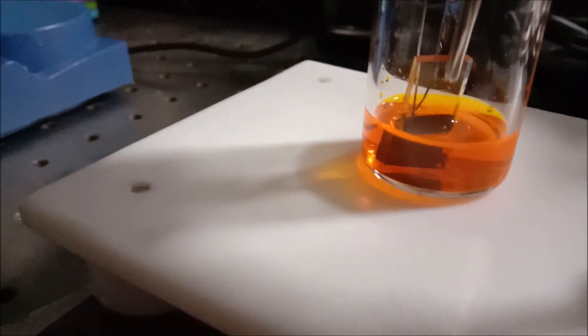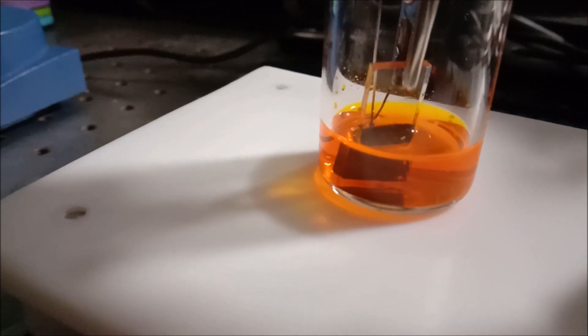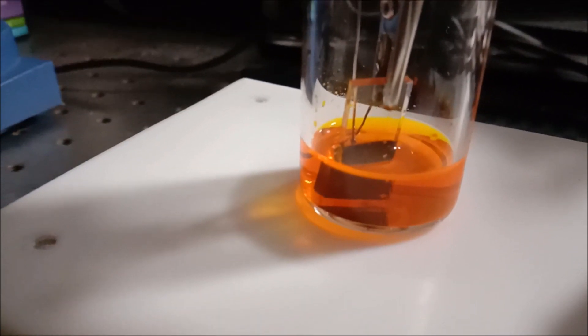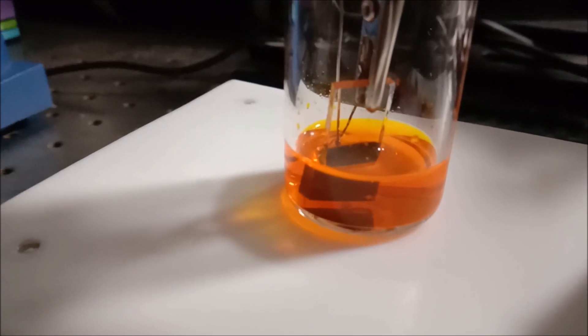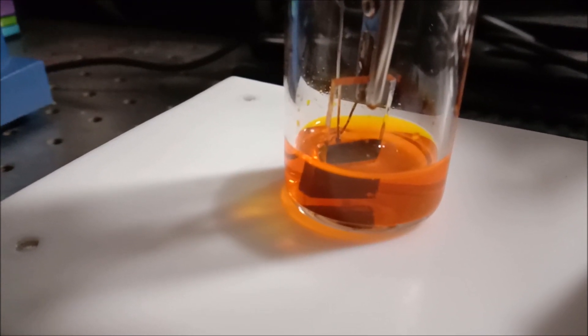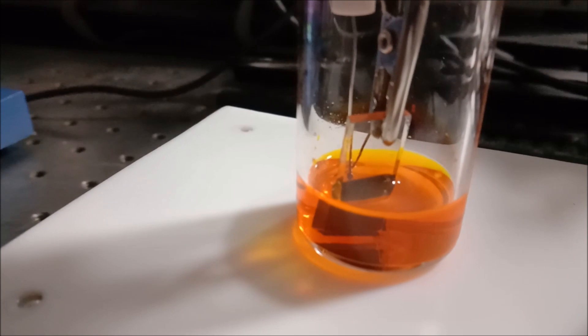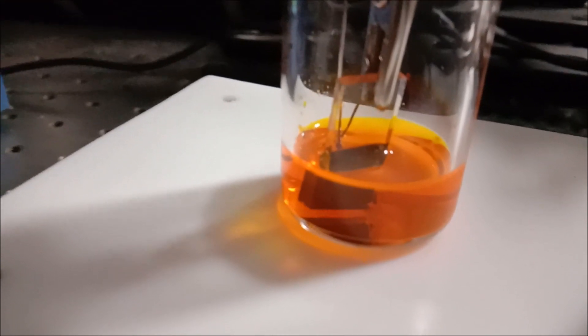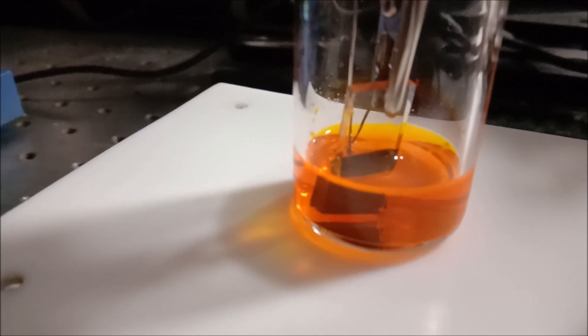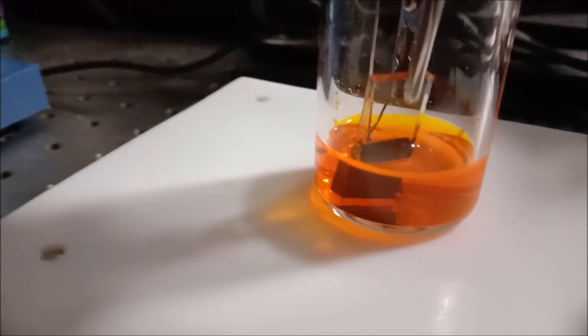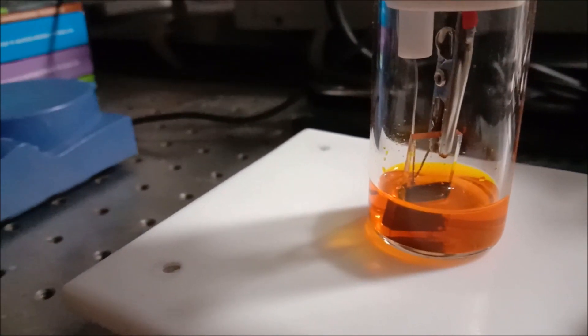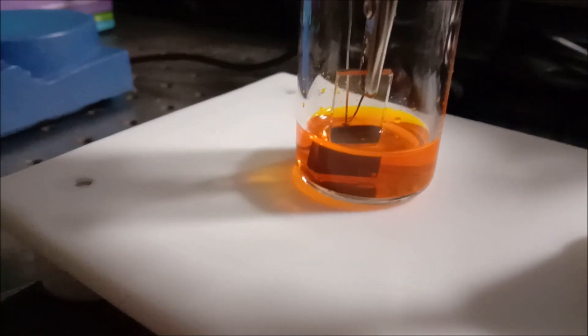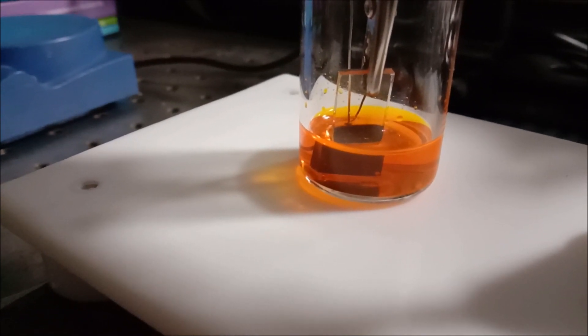We are performing now the chronoamperometry. If you don't have that amperometric IT curve you can still perform that electrodeposition using chronoamperometry. As you can see here it is a fast and effective technique. If you want to do electrodeposition or electropolymerization, I think you can use amperometric IT or chronoamperometry.